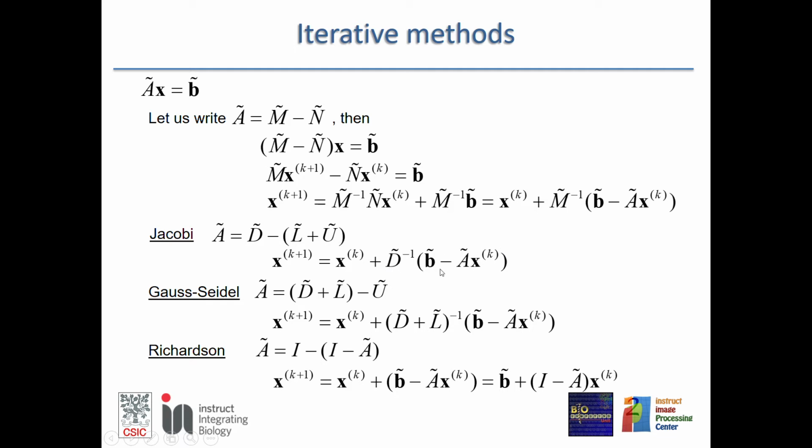If you think of this as a 2D image or a set of 2D images, you have to place them back in the 3D space so that you can add it to a volume. This operator here is coming from the ideal projector, which has some diagonal terms.